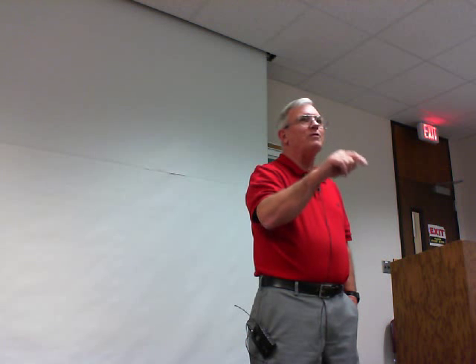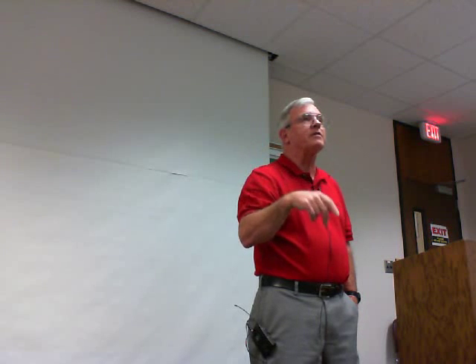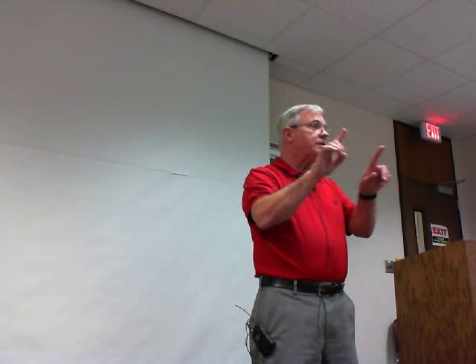It means don't move the microscope or anything else. If it's an organ identification, like if I put the spleen up and I say identify organ, I'll say you may move slide and change magnification. Now, when you're up there, don't move the eyepieces. You can change the distance between eyepieces, but don't twist the eyepiece because they will be fixed in place.